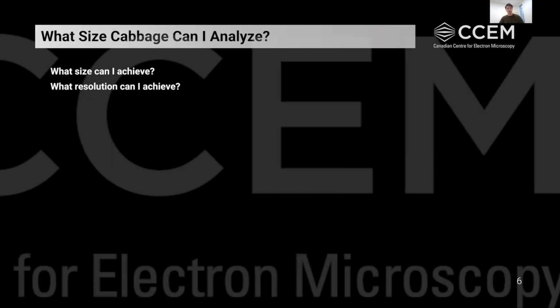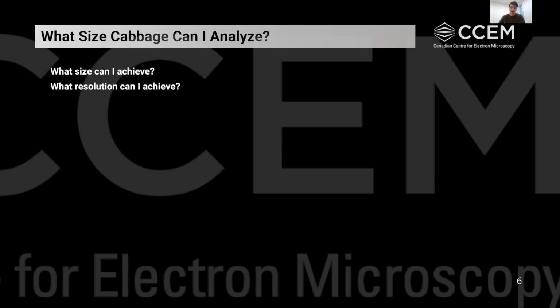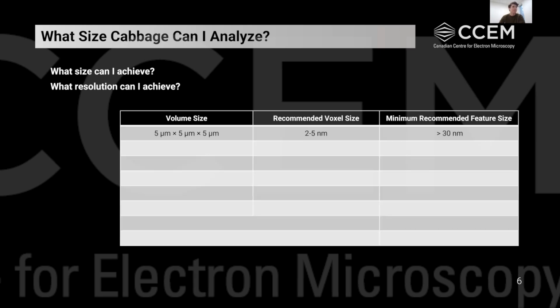But for now, one of the main questions we get when we run FIB-SEM tomography acquisitions is, well, what size sample can I analyze in the microscope? How big of a volume can I get with FIB-SEM tomography? And what resolution can I achieve using that volume?